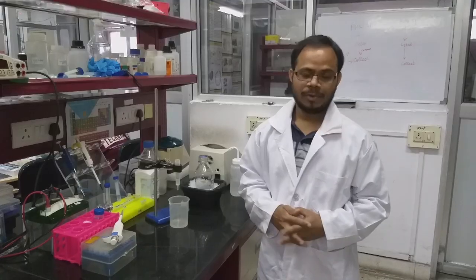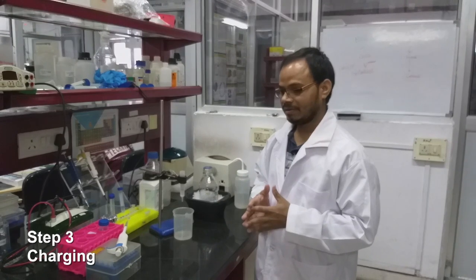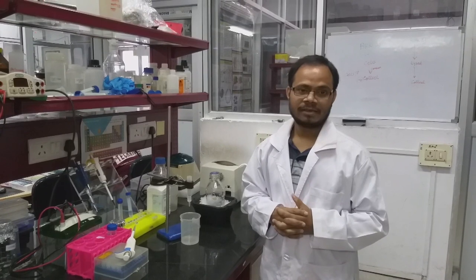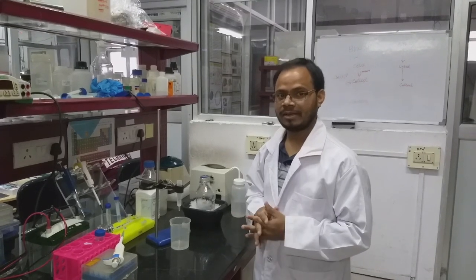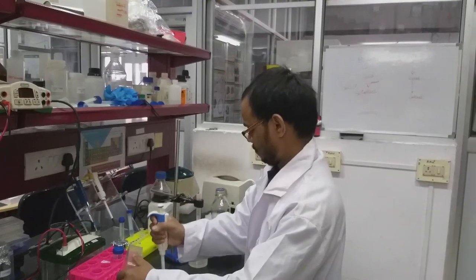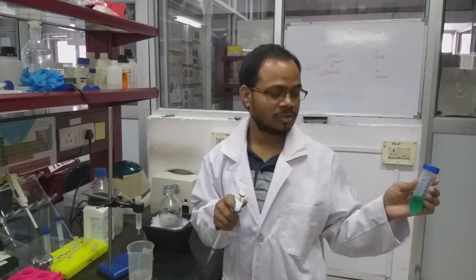Before equilibration of the column, we have to charge the column. For nickel NTA, there are two types of beads. One is readily charged beads which come from the company, and the other, they give only NTA agarose beads, which we have to charge. So here we will charge the beads with nickel and then we will equilibrate. We already washed the column with water and 0.2 normal NaOH, again with water. So now we will equilibrate. This is the nickel chloride solution.